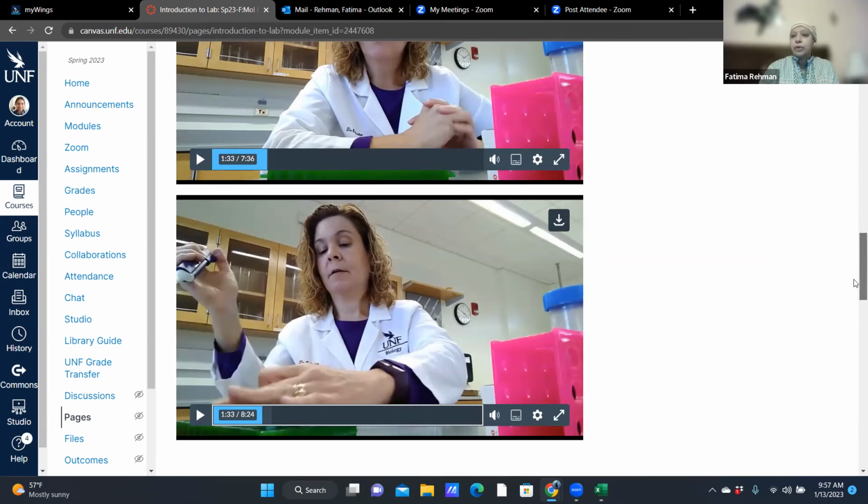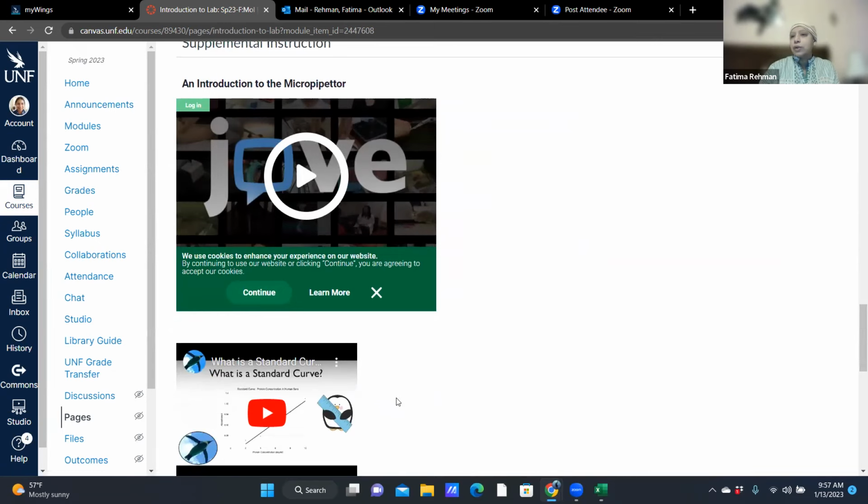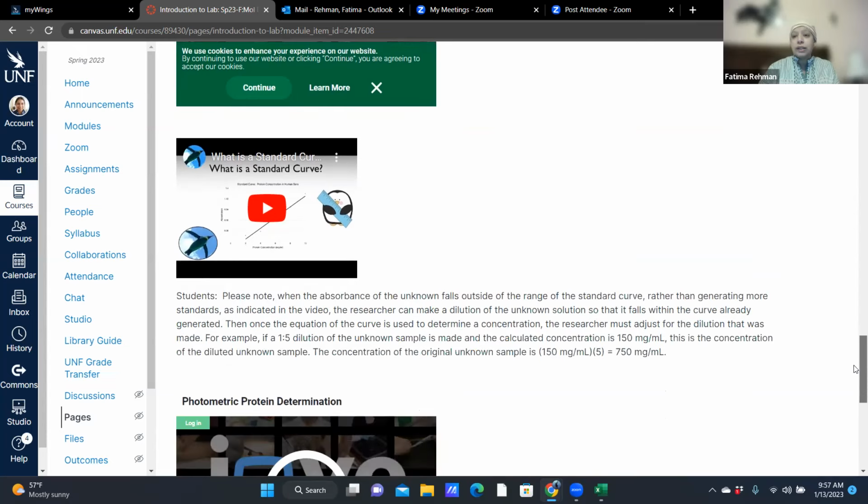She'll have both of those parts in here, and then there'll be some other videos that you can watch to get the background information. All of these are important in their own way to help you learn the technique, what the system is for, what each chemical is used for, and also how to troubleshoot any issues that you have with your system.